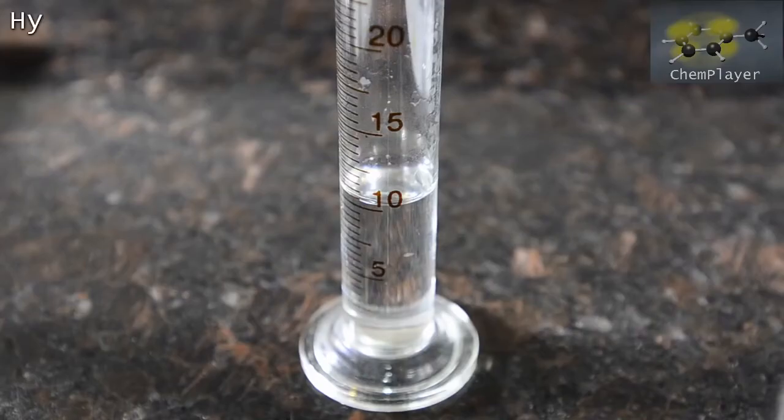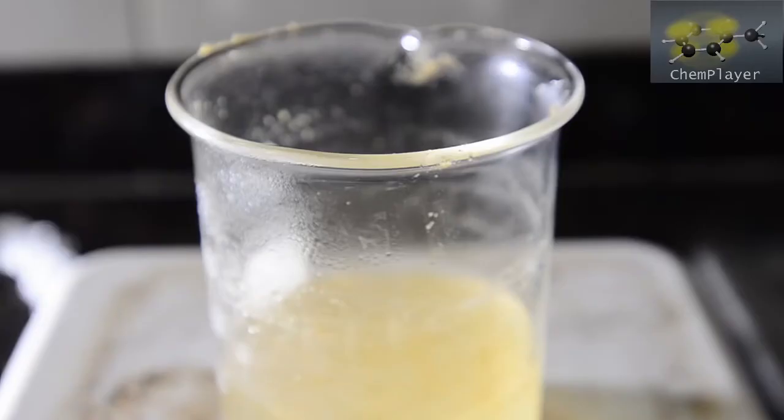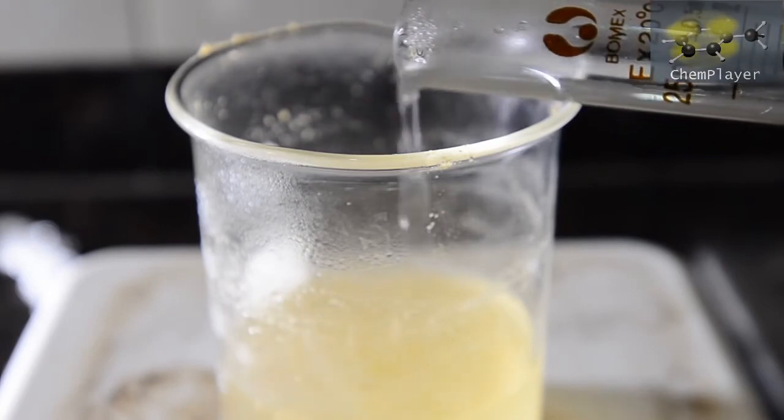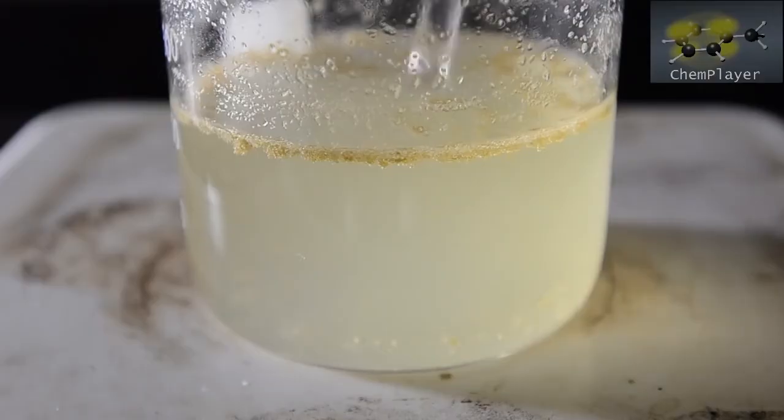Here's 10 ml of concentrated hydrochloric acid, which should be more than enough to convert all our product into the carboxylic acid. We add this to the hot mixture. Let's check the pH.